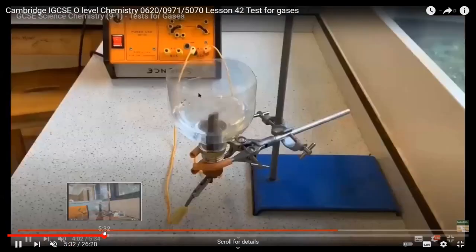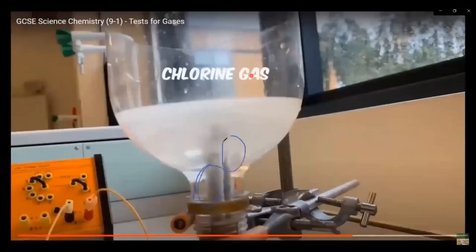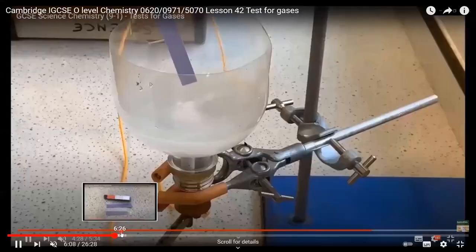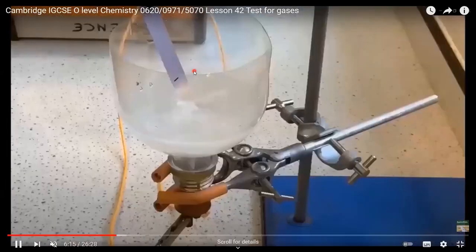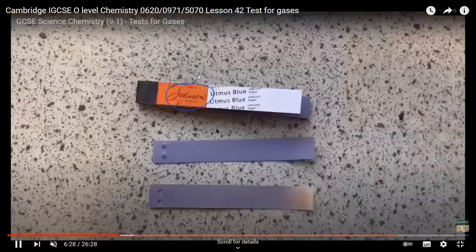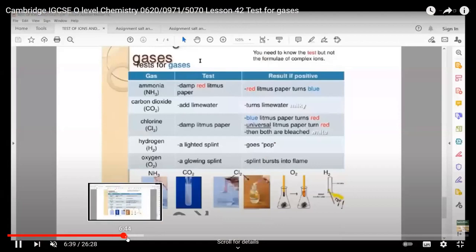First, we are producing chlorine gas here. This is how chlorine gas is produced by electrolysis. Now, what is the test for this chlorine gas? Again, you don't have to learn how it is produced; you have to learn the observation. We test with a damp blue litmus. First the litmus paper will turn red and then it bleaches. As you can see, first it turned red, and with the passage of time this litmus paper will bleach. So first it was blue, then it turned red, and then it bleached. Bleach means the color is removed. So this confirms the presence of chlorine gas.